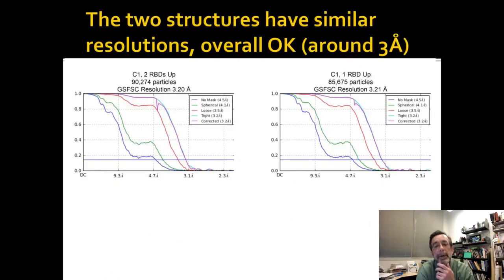And this is the graph that you want to look at. For this one, they actually don't give you 1/angstrom units. They give you regular angstrom units like I'm used to. And you can see that they're comparing different mathematical reconstruction techniques that they used. If you look over here, you have the different colors, and this shows you not just what the resolution is for the molecule, but if half the molecule has a worse resolution than the other half by this technique.